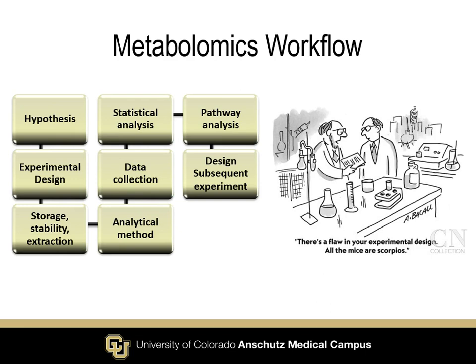And you want to go on to do some type of pathway analysis, and this is the good part about it, the subsequent experiment that you want to go on to afterwards. So essentially most of us start with a small pilot study, and then from those results we can go in and do a large study, increase our N, or power.